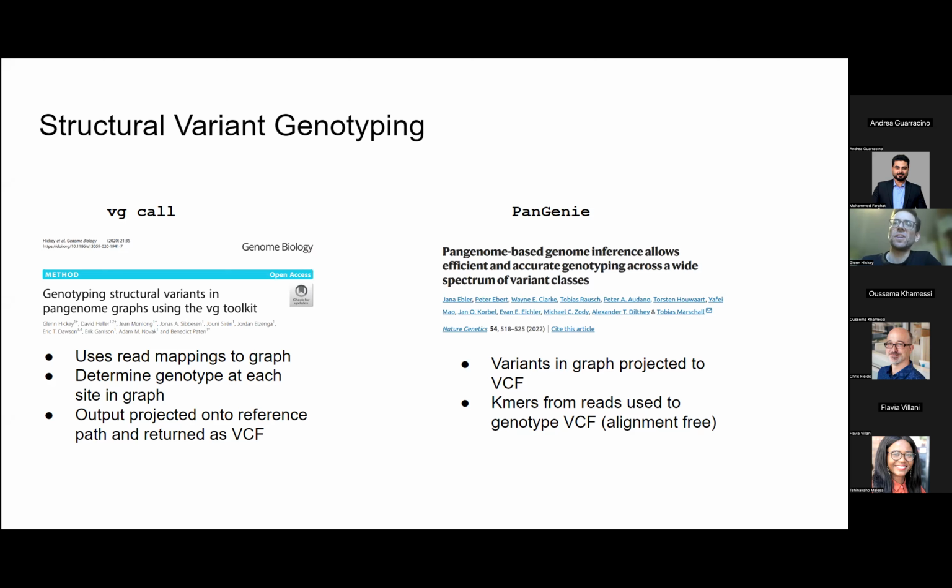Usually you would do that to GRCh38. So you change your graph alignment to the linear alignment. And there's a value in doing so, because some of the reads that you mapped accurately with your graph you would have maybe lost completely by starting with the linear reference, you sort of rescue those and can project them to the linear reference. Next slide.